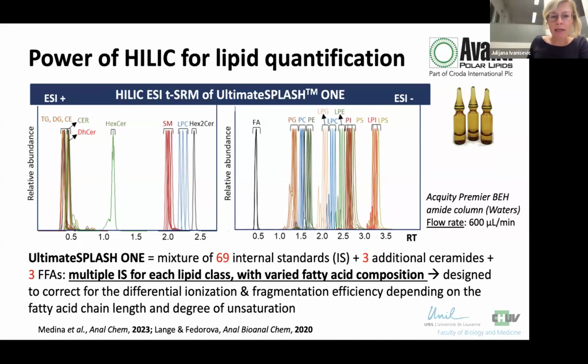Okay, so one of the main advantages would really be the sensitivity for the detection, and then also the reliable measurement of these lipid species, which are low abundant, if you want. So if we compare directly the coverage of the direct infusion analysis with this HILIC method, you would really see that we globally cover a higher diversity of lipid species, especially when it comes to the different classes of phospholipids and sphingolipids.